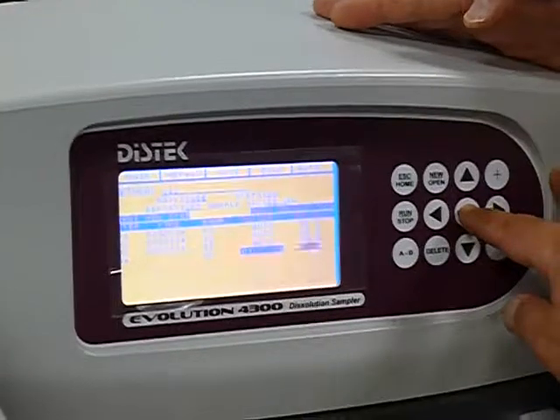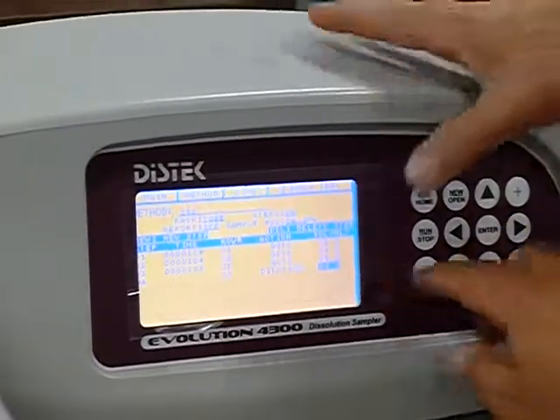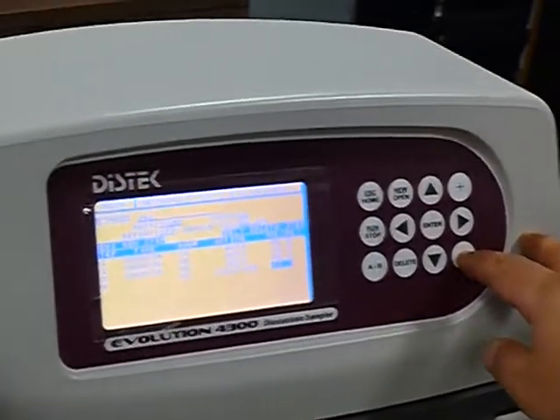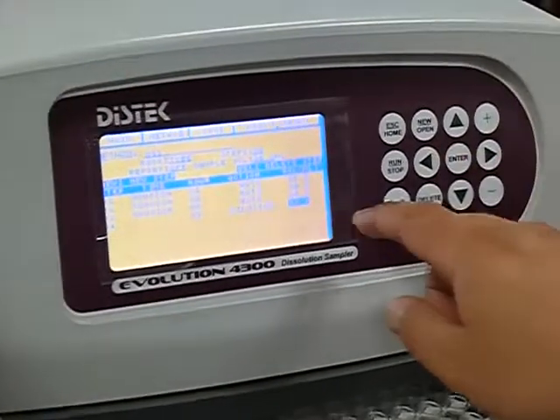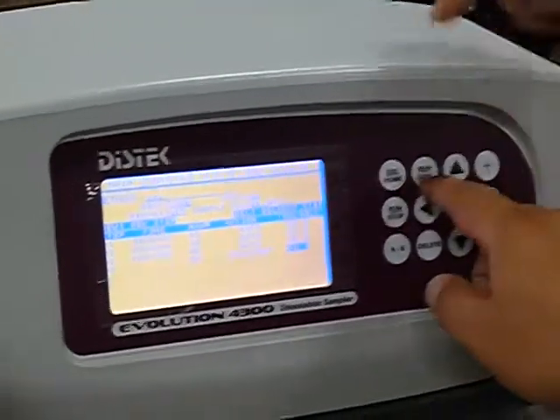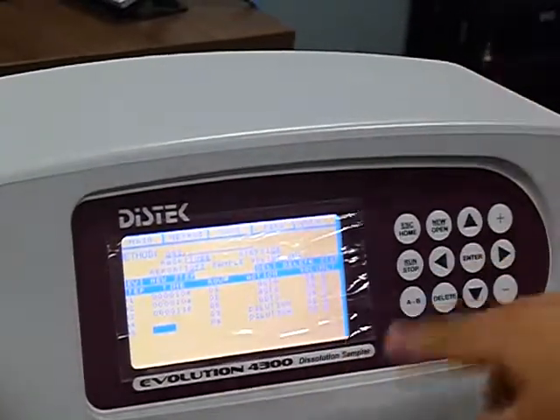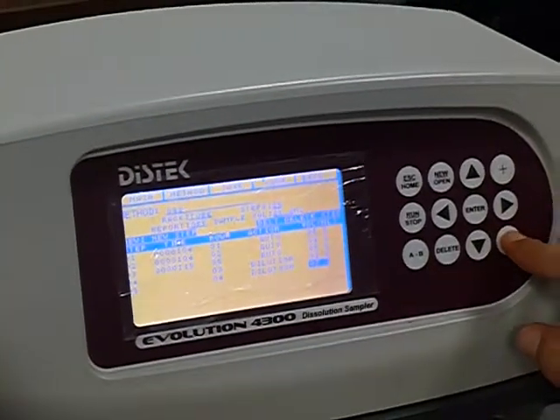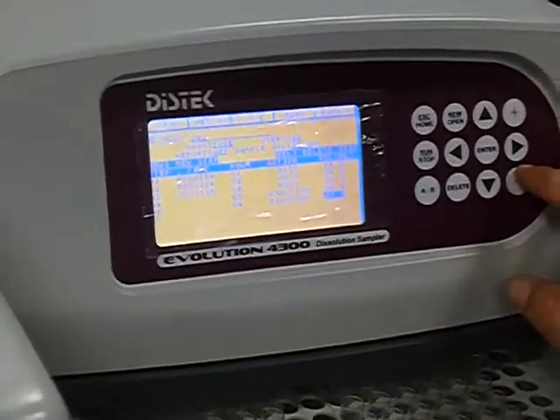Okay, then get back over to dilution, and if you hit new, you can make that 8 mils, 2 mils. Or you can just hold it and it'll do it real quick. And then when you are here and hit enter, now you need to hit new, or open. It'll copy whatever the last function was, dilution. And see, it automatically brings you to the next row, and then you just need to make that a 3. That's it, and that's row 4.